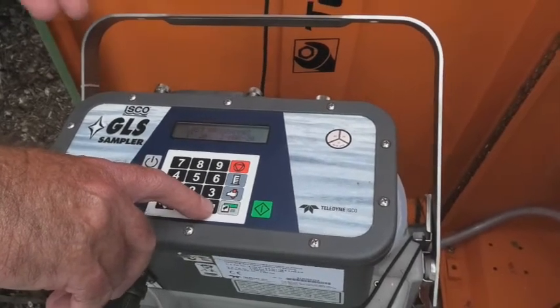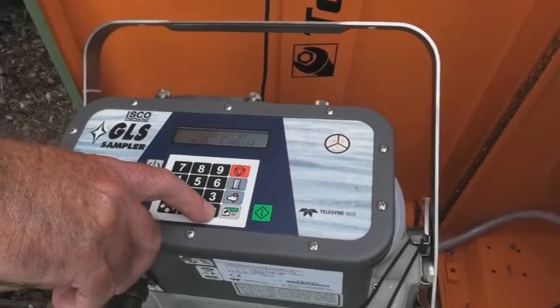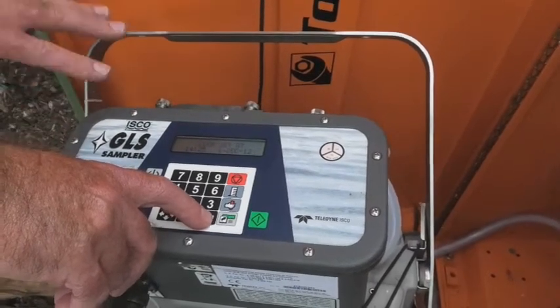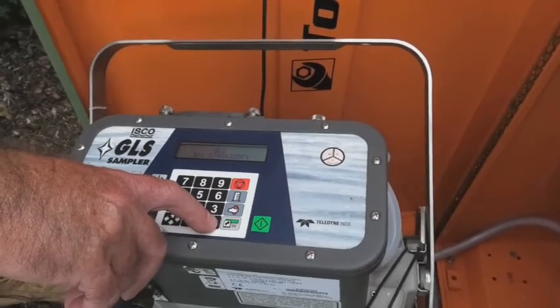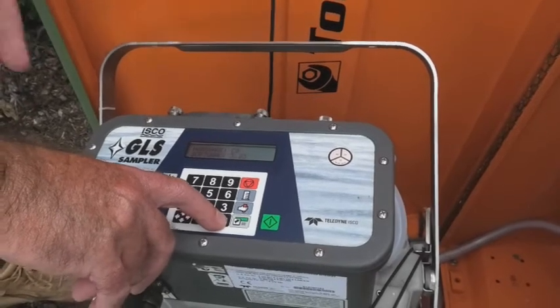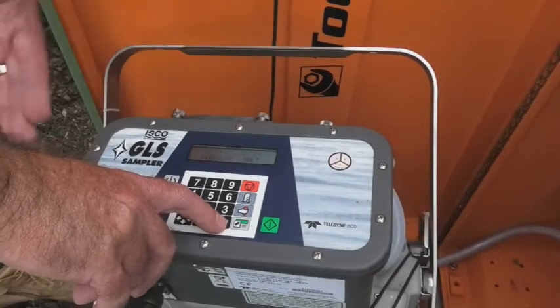When we first put a program into the sampler itself, the clock is shown so you can check whether it's right or not. At this stage we're not really using time pacing on this so the clock isn't all that important to us. It gives you an idea of the sampler, tells you the programming, and the firmware that's actually on the sampler just in case you need to update that. And then we'll go back to that start screen.